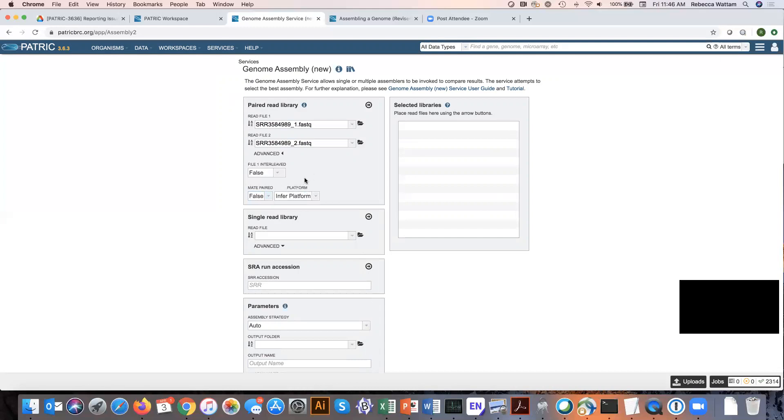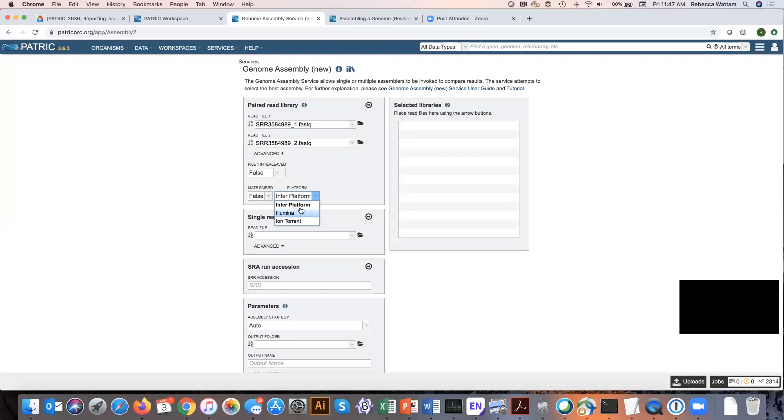The last is inferred platform. You notice that the default says infer platform, but if I click the down arrow here, you can select Illumina or Ion Torrent. Those are the only two sequencing platforms we know of right now that have paired end reads. I'm just going to leave it at inferred platform.